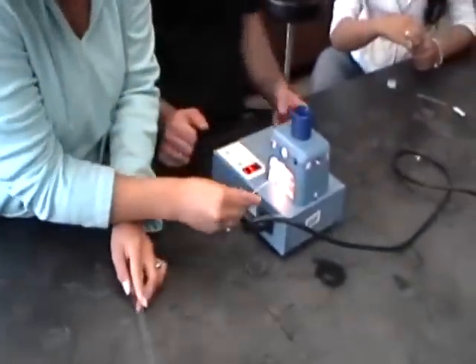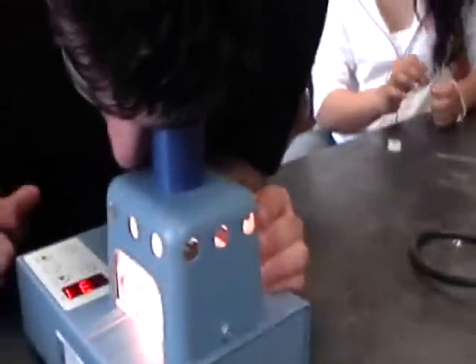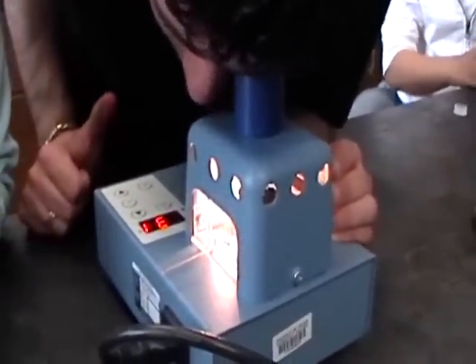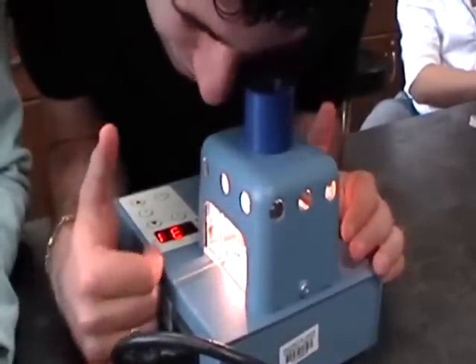Put it in the device in the middle. Now we just wait until the substance melts and record the temperature. How long do you think it's going to take? I think it's going to take like two minutes.